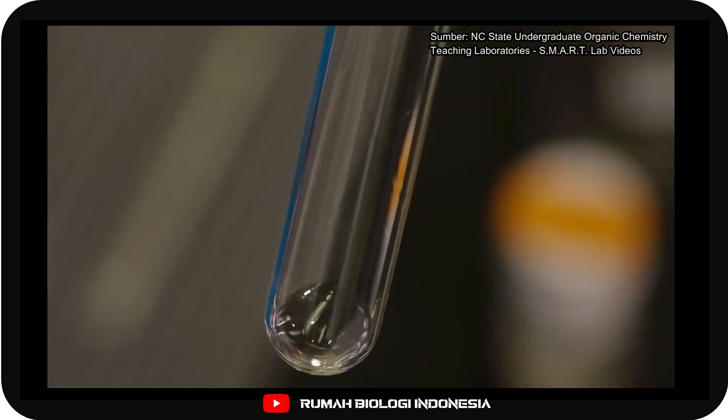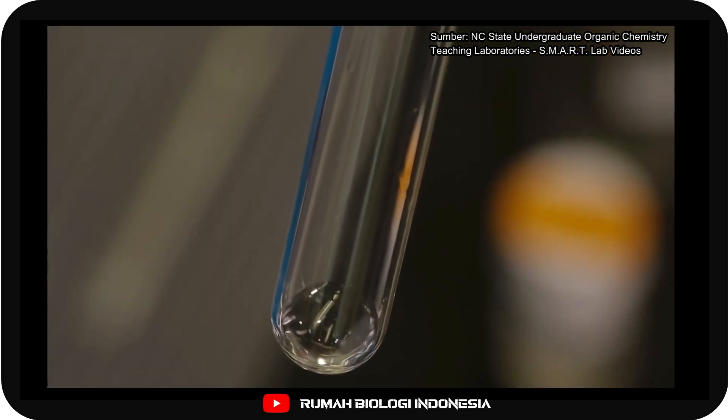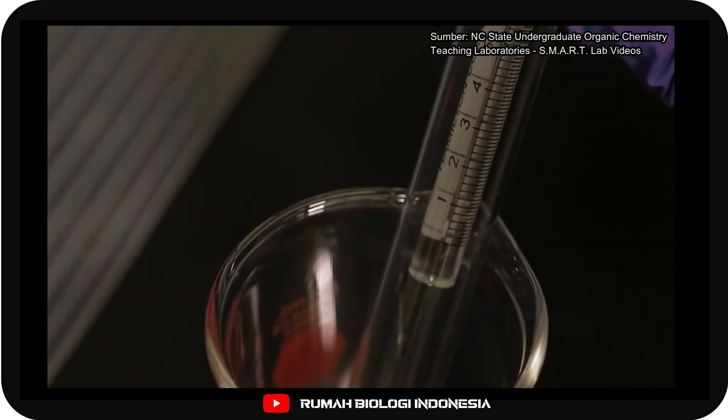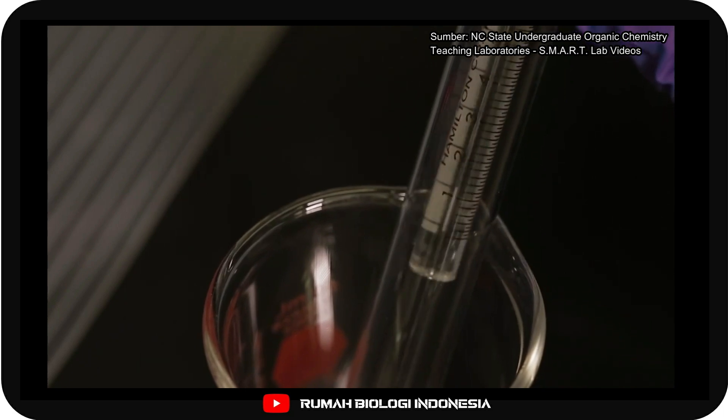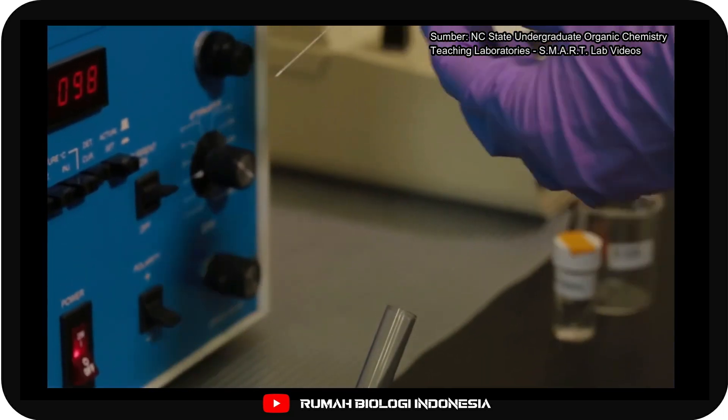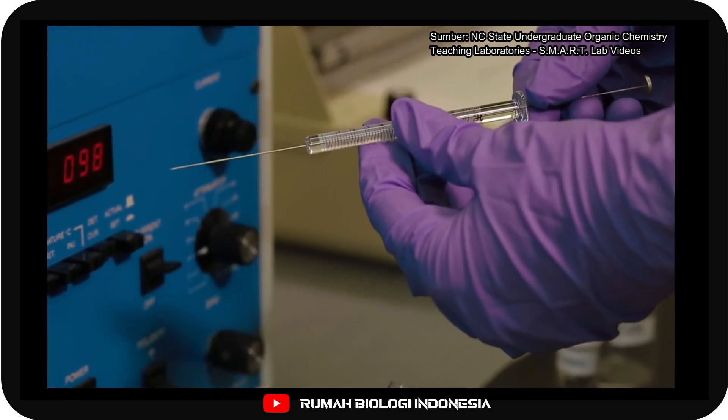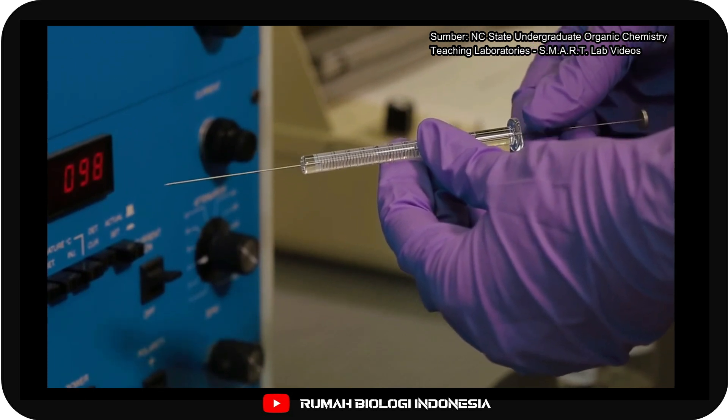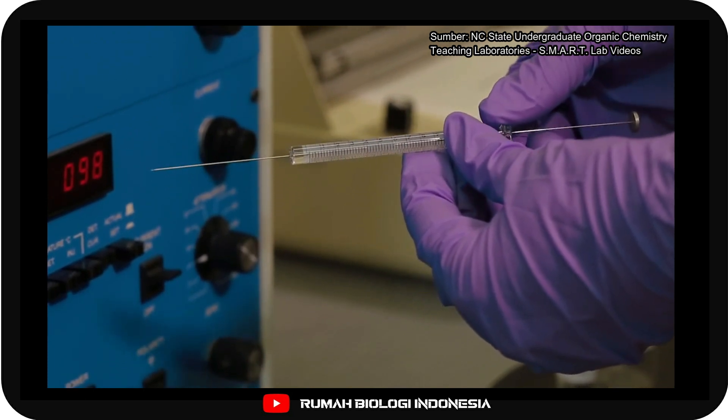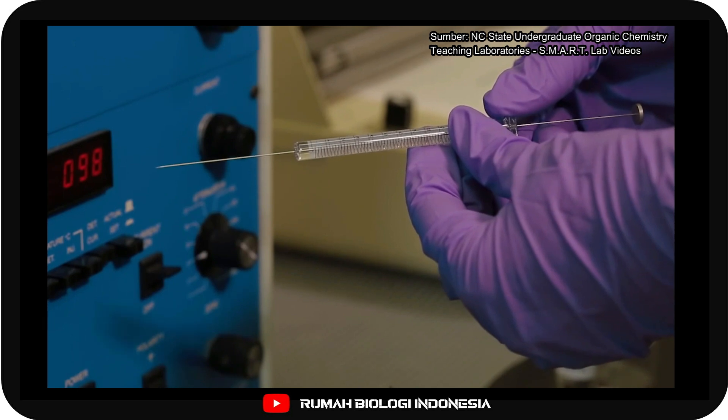To run a GC, you first need to prepare the sample for injection. Using a small syringe, collect between 1 and 5 microliters of the sample in the syringe, followed by 3 to 4 microliters of air. Be sure that your sample is free of drying agent to avoid clogging the syringe.